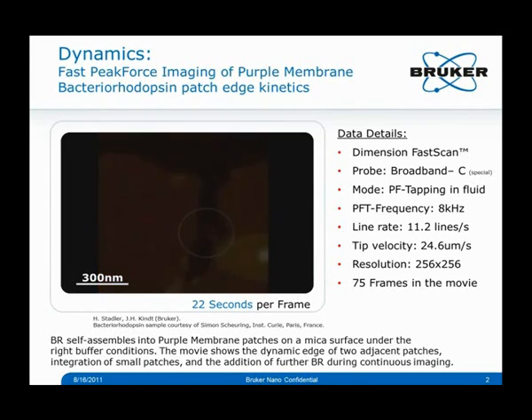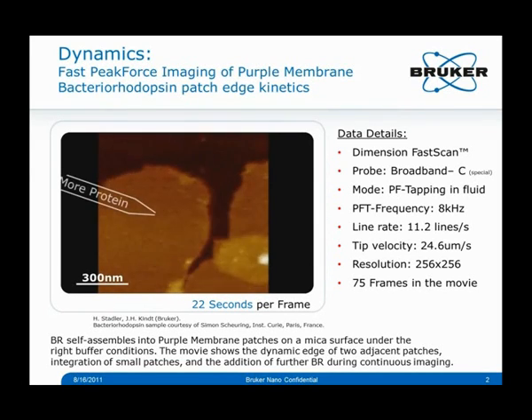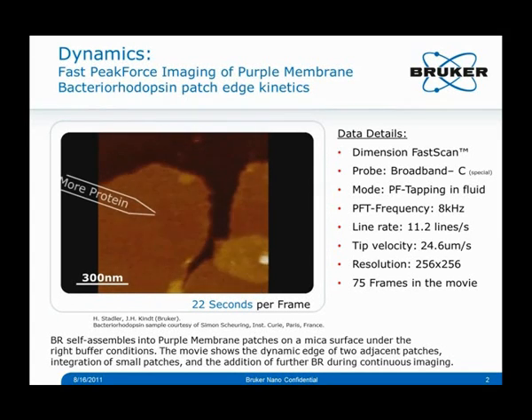Lateral stability becomes much more important when taking movies, because over a single frame, while it can cause a little distortion, over a whole movie it will really shift around the field of view and become much more apparent and much more annoying. So the stability seen in this little movie here is a very good thing for studying dynamics.